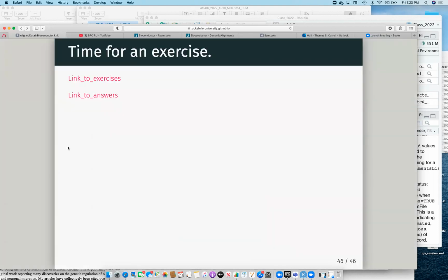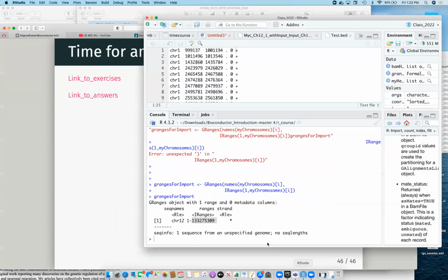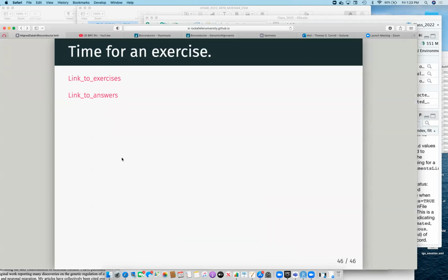So that's an intro to alignment, and I'm really showing you the basics there. It gets deep. They've got some really great tools there, including what I haven't shown you, which is how you can really play around with the junctions. They've got very clever ways of extracting junction and read information. But we don't need that to do what we're going to be doing in the future sessions. So if you want to know, just ask me and I can always talk you through it.